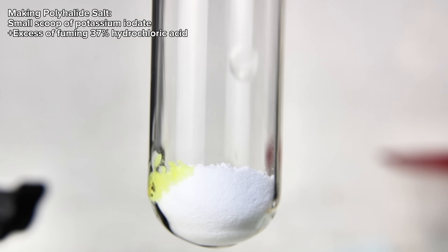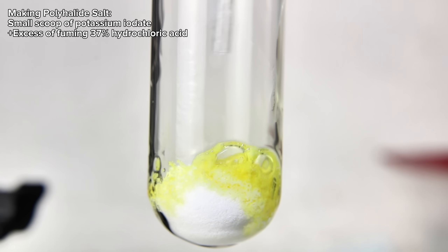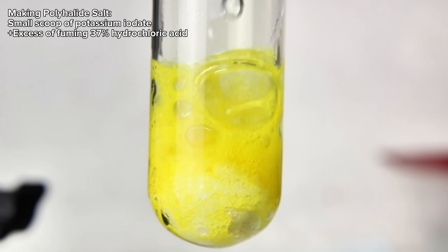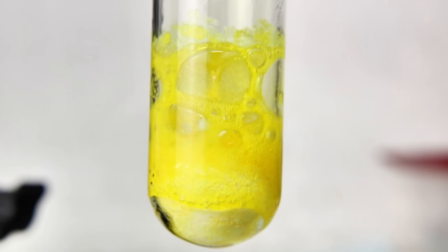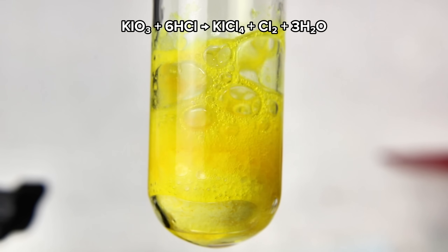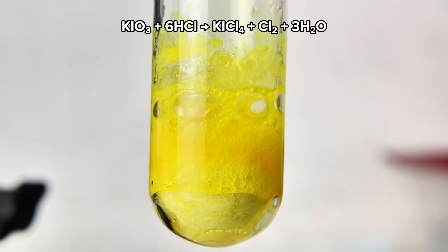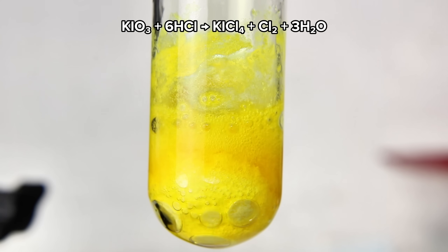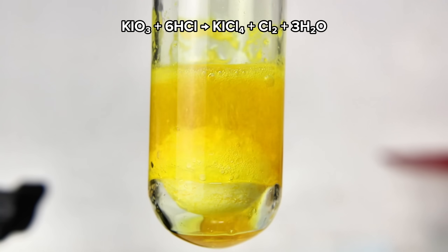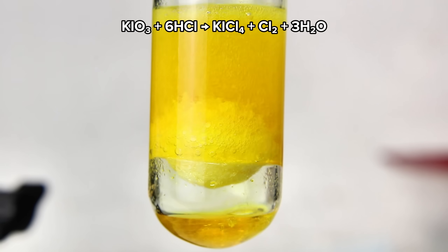To this end, I simply added a small scoop of the potassium iodate to a test tube, followed by a few milliliters of fuming 37% hydrochloric acid. This immediately resulted in a large amount of bubbling as the iodate oxidized the hydrochloric acid to chlorine in water. Alongside the chlorine gas, this reaction forms the polyhalide anion iodine tetrachloride, which imparts a bright golden color to the solution.